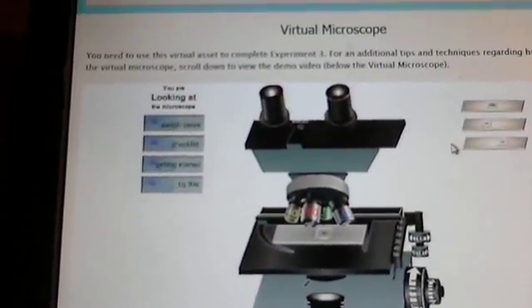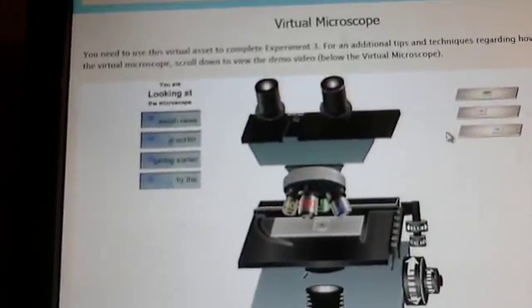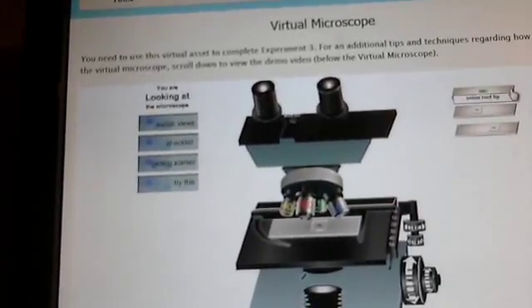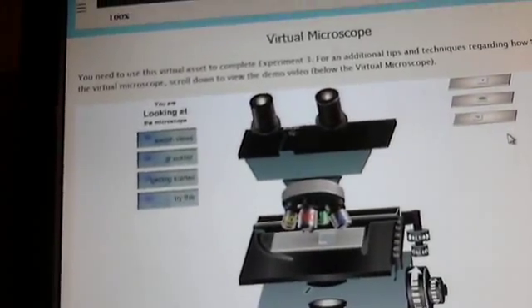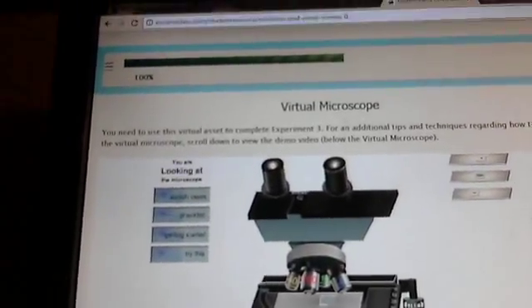Okay, once you brought that out, then it says once you leave the E, remove the letter E slide and check the cheek smear slide. So add the cheek smear slide on the right side of the page, manipulate the stage so that it samples over the light source.